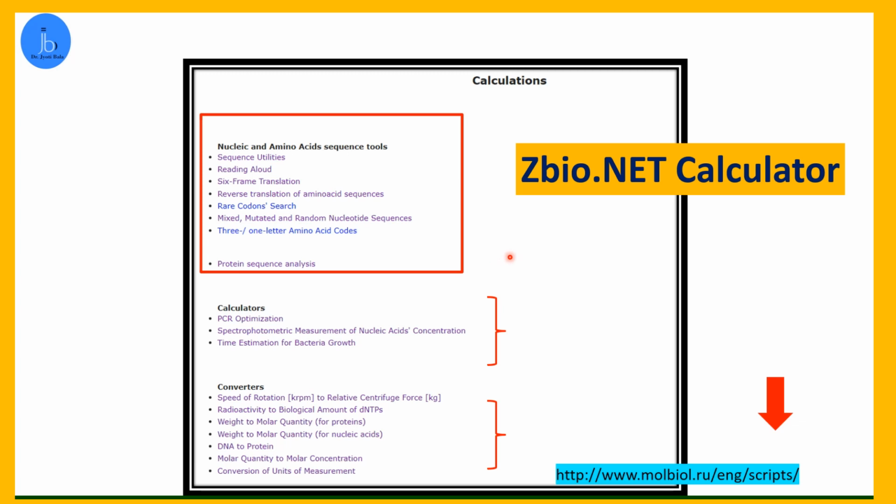these things. And if you are working on radioactivity, then you have to perform scintillation related experiments. Maybe you are doing spectrophotometry related experiments for your purifications and concentration calculations. Then you can easily utilize this tool. It's very useful and it's very simple also.